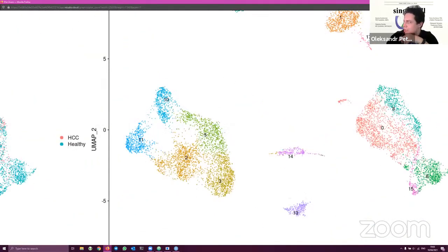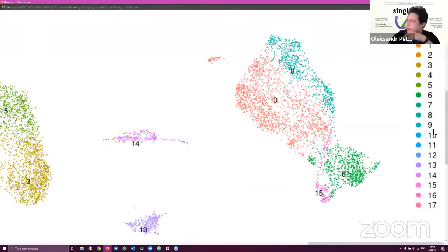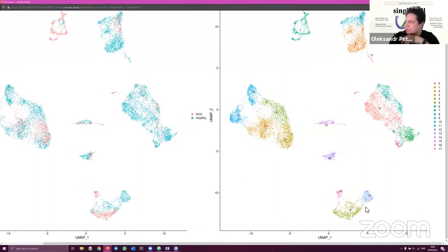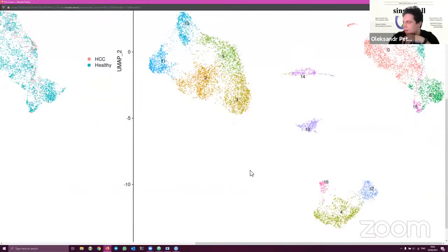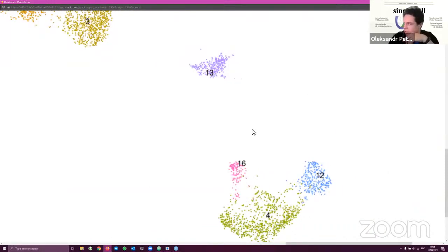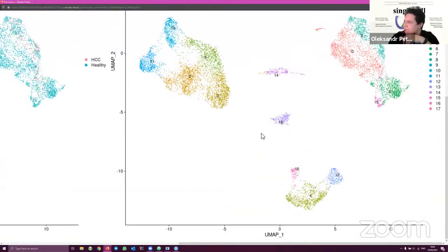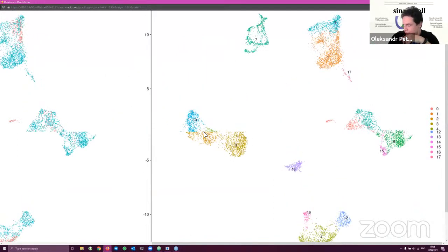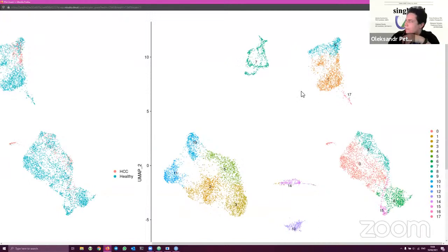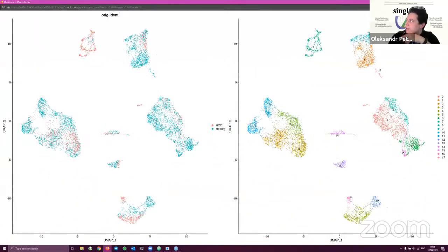So we have detected 18 communities, as it was written to us before, and we have here from 0 to 17. So in total, it's still 18, but it just starts from 0. And here we can see how many communities we have and where they are located. For example, these ones are located quite close to each other, but still 3 different clusters according to their anchors or expression features. Here again, we can see quite a lot of different cells.